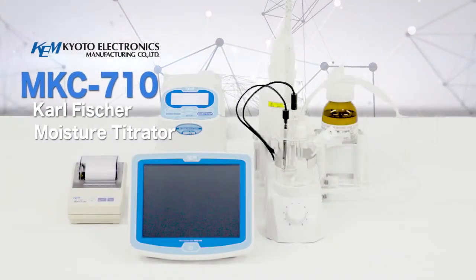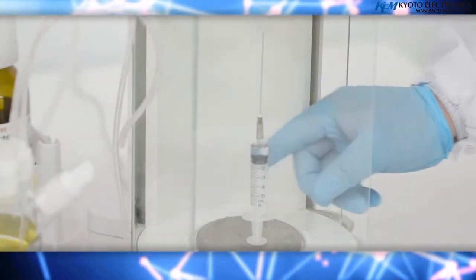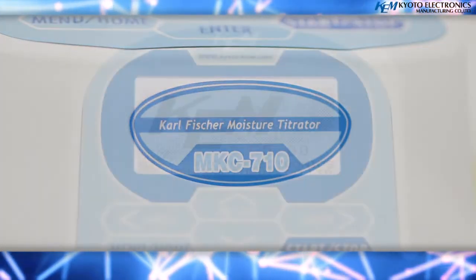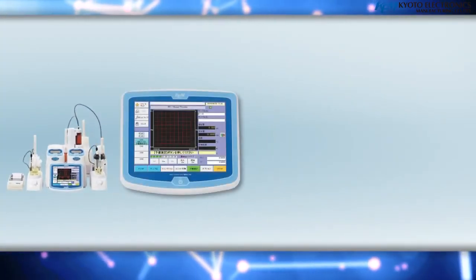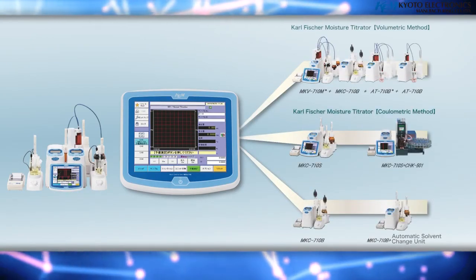Karl Fischer Moisture Titrator, MKC 710. The MKC 710 is widely used for determining the moisture content of various substances as a reliable moisture meter that has been adopted in many official analysis methods such as the ASTM, JIS, European Pharmacopoeia, and the United States Pharmacopoeia. By connecting up to 4 moisture titrators, measurements can be performed simultaneously in parallel and contribute to saving space.